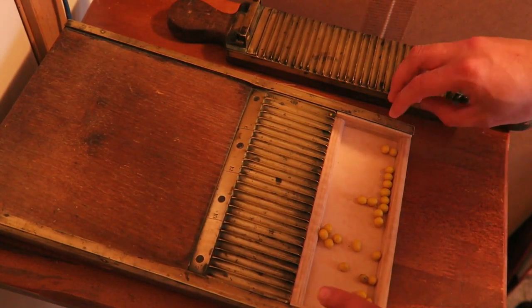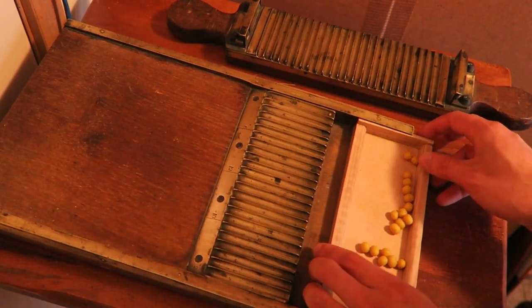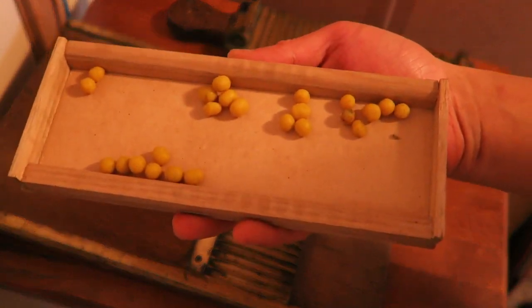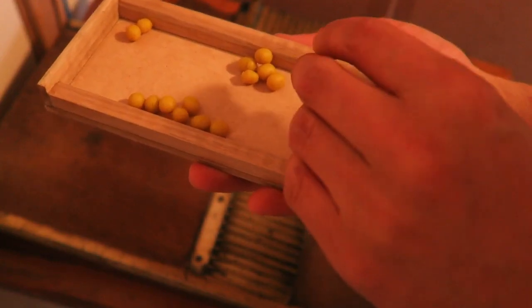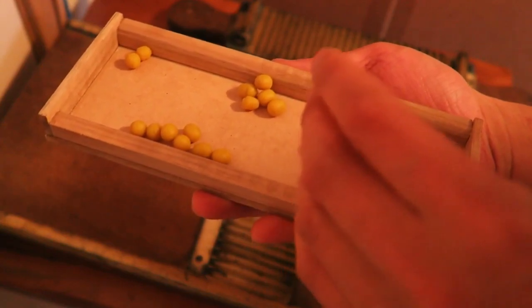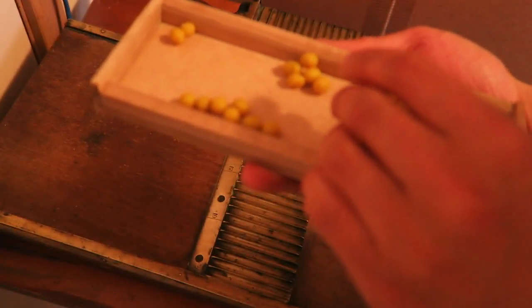And here you would have your pills. This drawer is removable — you would pop this out like this, slide it out, and here you would have all your pills. What you would do then is let the paste dry out and the pills would come nice and firm, and you could put them in jars and bottles and sell them.